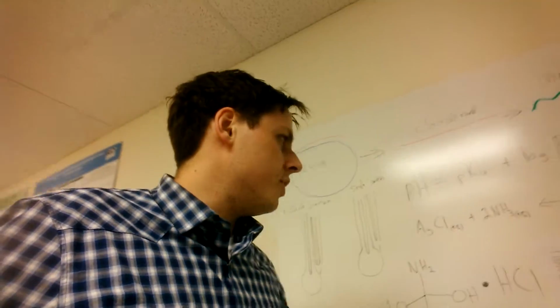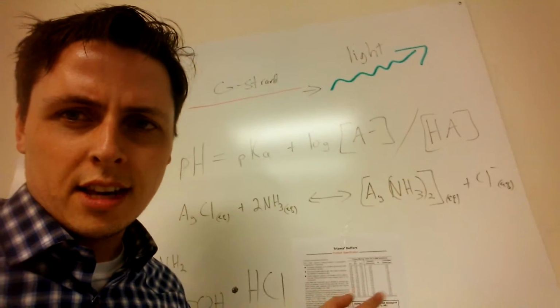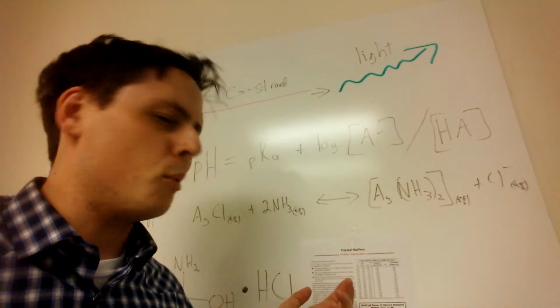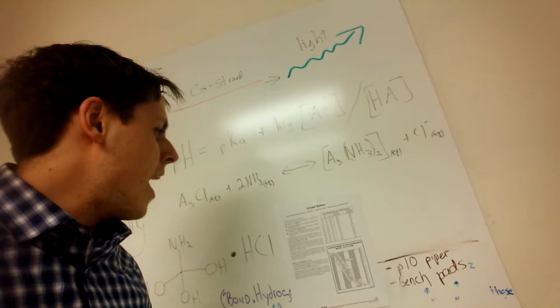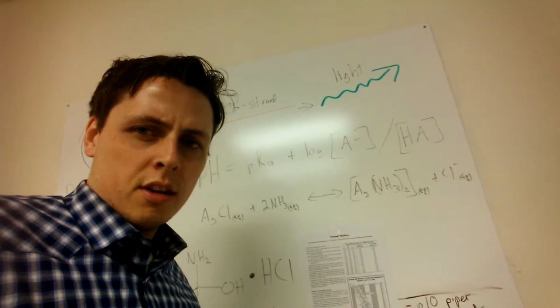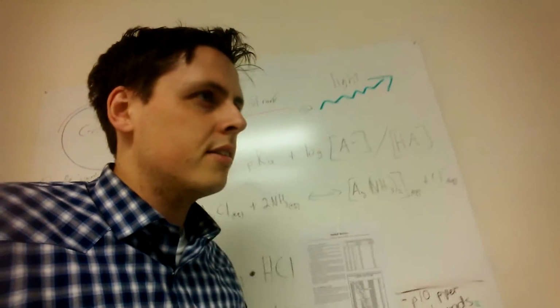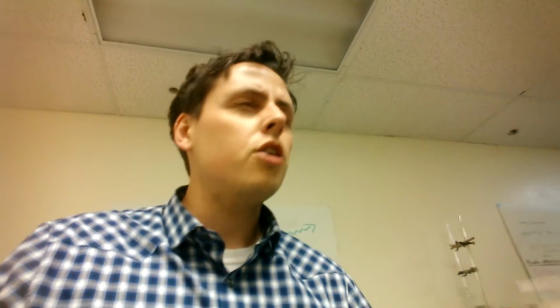So what you use is something called Trizma, Tris base and Tris HCl. I'm pointing at the wrong things. This is my first time doing this. And these are tables. The math is already done for you. You just have to measure out the weights, and then you have the proper pH once you add those powders to water.